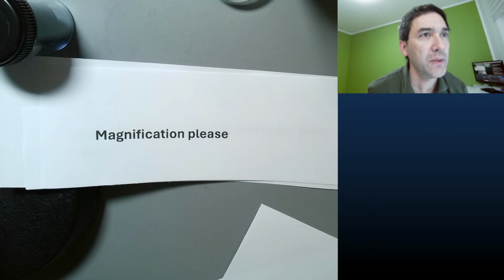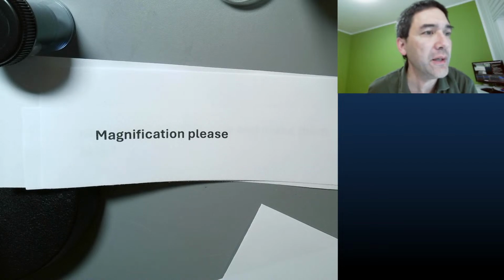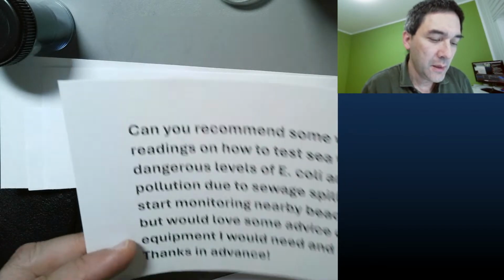Sometimes the computer is a little bit, how do you call this, exerted because I've got too many cameras connected. This is a little bit frustrating. So what I'm going to do now is try to deactivate it. Nah, you know what? I'm just going to continue like this. It's better than nothing. So I'll simply move on here.